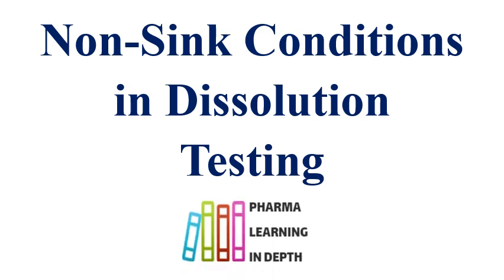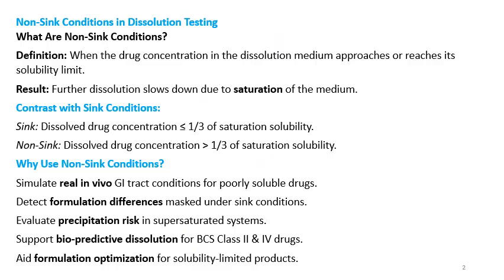Welcome to the video on non-sink condition in dissolution testing. It will be a short video to understand the sink and non-sink conditions, and this video will give you information regarding the non-sink conditions, why these are important to understand for the non-sink and sink condition, and how these will impact.